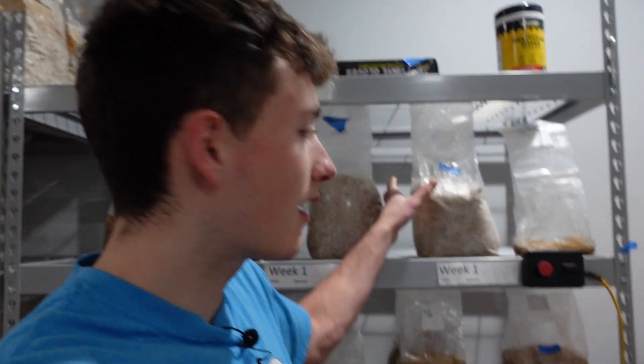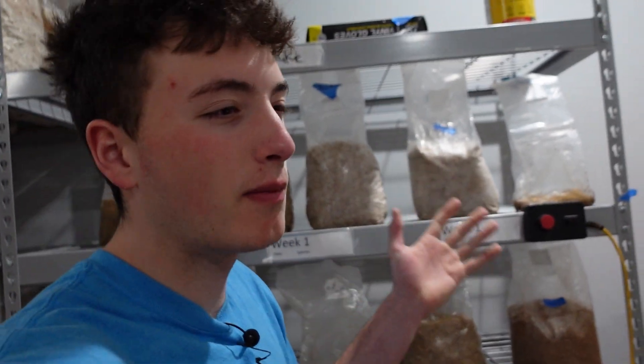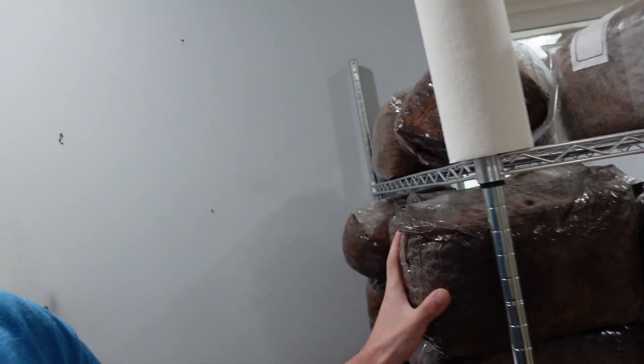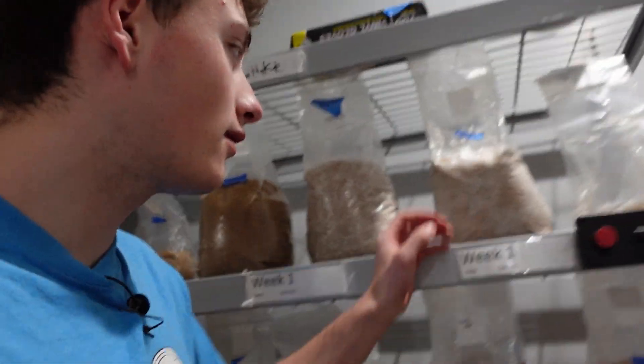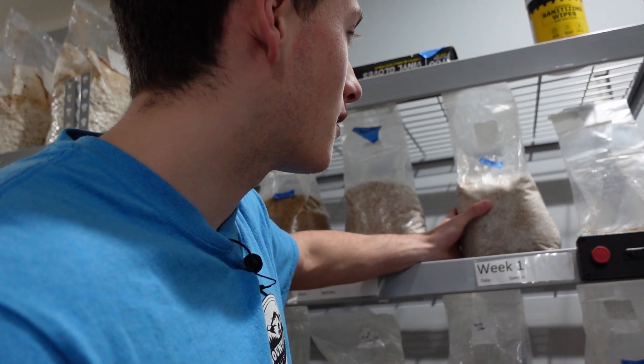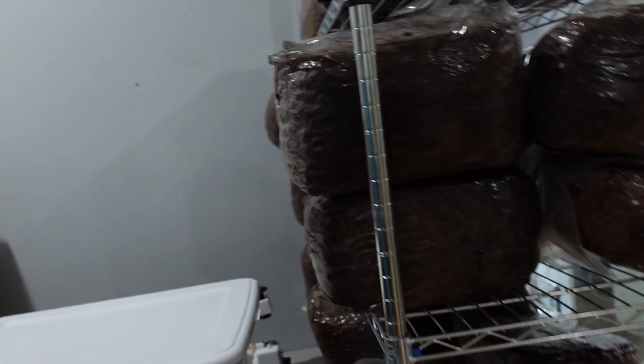Today I'm going to be showing you guys how to inoculate mushroom blocks using grain spawn. So here we have our spawn — this is a blue oyster mushroom spawn. Basically what spawn is, it's just a nutritious grain that you can apply to your main bulk substrates, your blocks. These are just mixes of soy hull and hardwood, so 50-50 of that material. And then we obviously hydrate it and then sterilize it.